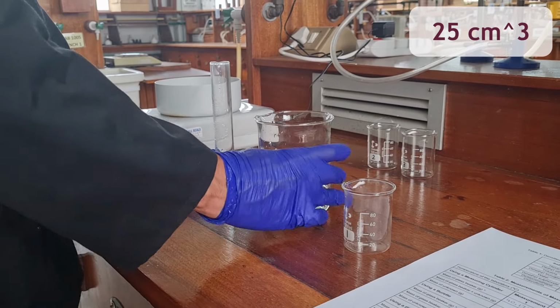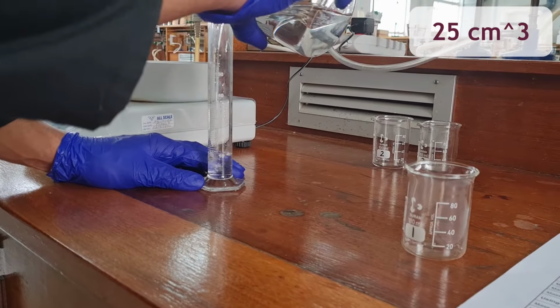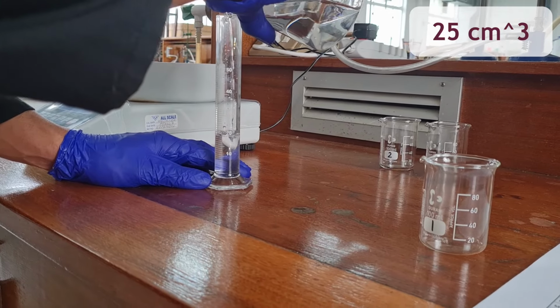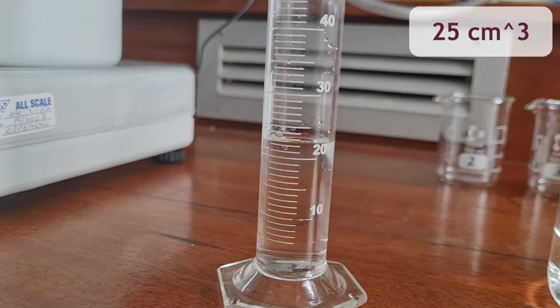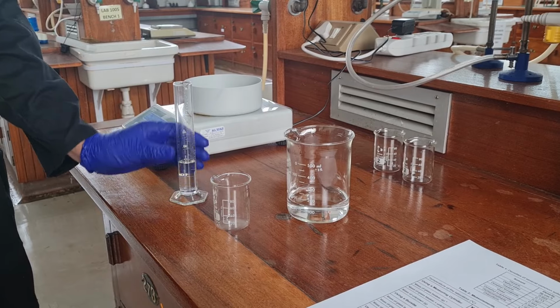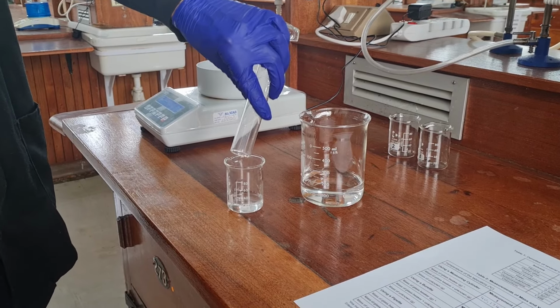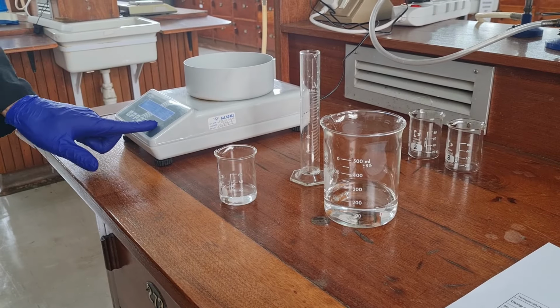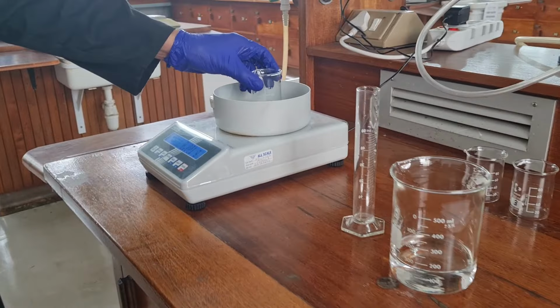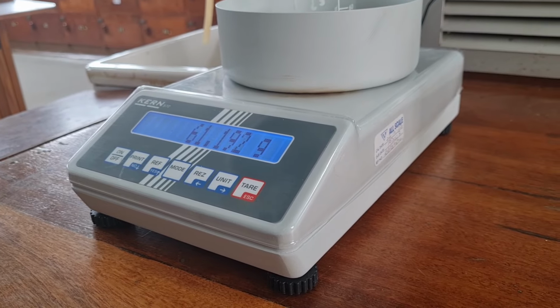Measure 25 cubic centimeters of the unknown solution into a 50 cubic centimeter measuring cylinder and pour it into one of the 3 weighed 100 cubic centimeter glass beakers. Repeat this for the remaining 2 100 cubic centimeter glass beakers. Now weigh the beakers again and make note of the new masses. Record this under measurement 1, 2, and 3 respectively. This is a recording of your mass of the glass beaker and the solution.